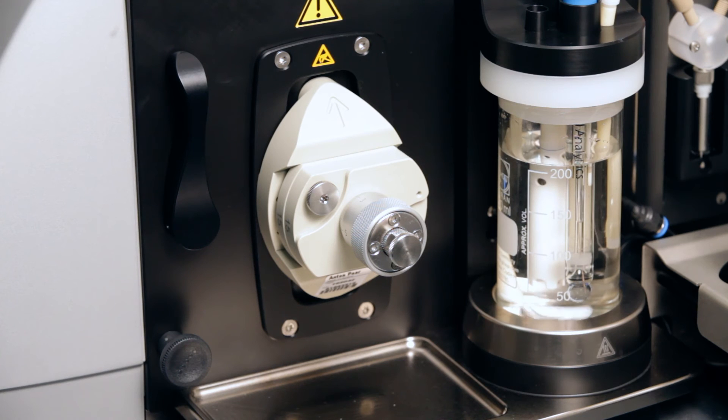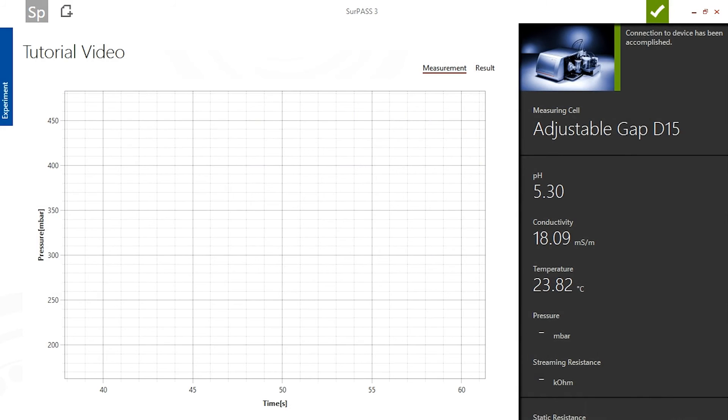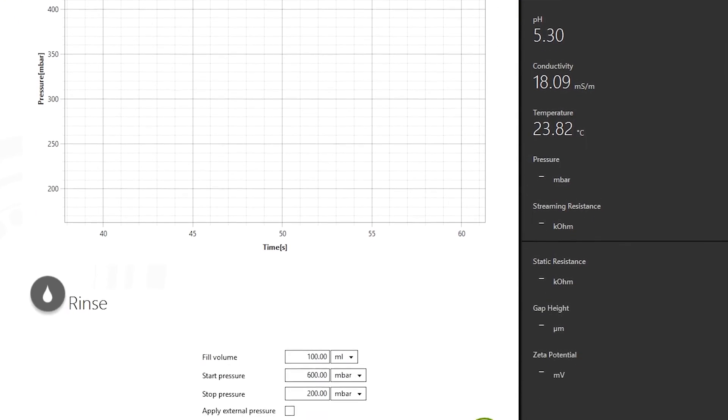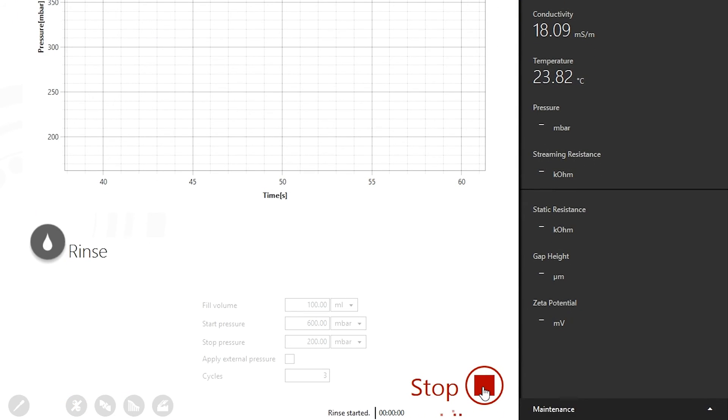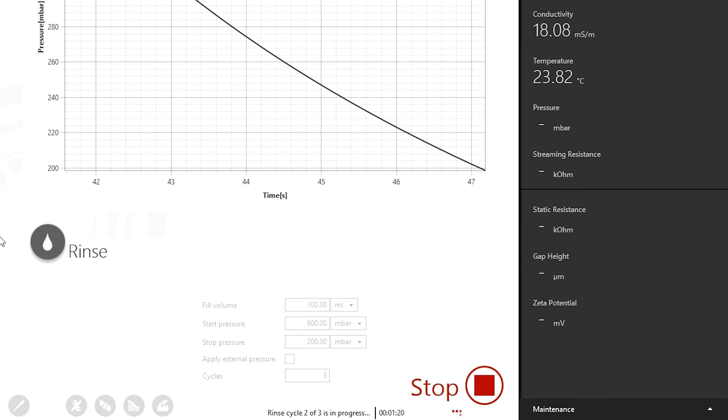The adjustable gap cell for discs is then recognized by the Surpass 3 software. Use the rinse cycle to adjust the gap between the sample surfaces while filling the cell with measuring liquid.